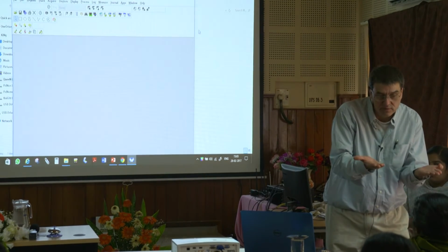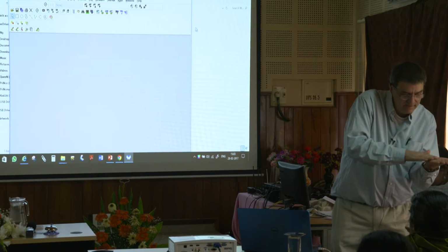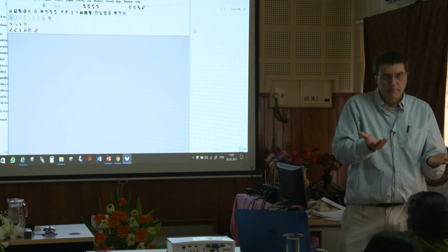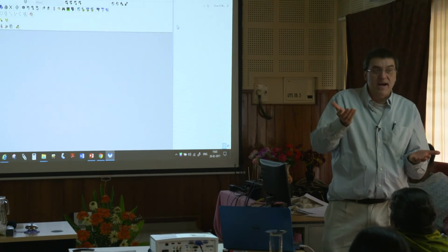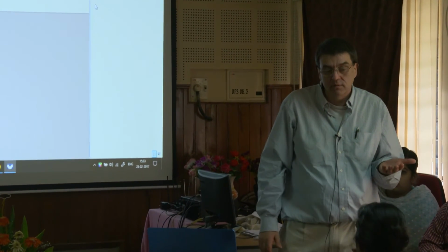By looking at those two, a lot of times you can determine that, hey, this is brighter, this is my real stuff, this is all my background. If you look at the two images side by side, you can sort of tease out what's brighter. But a lot of times when it really works, the signal is just five, six, seven times more intense, and it becomes really obvious that that's your signal.